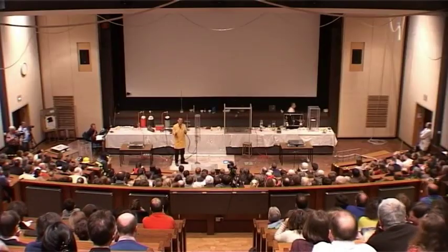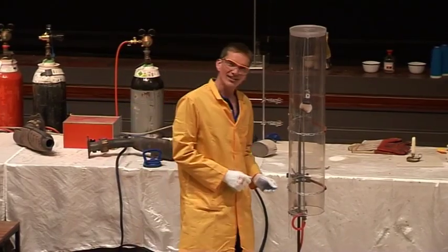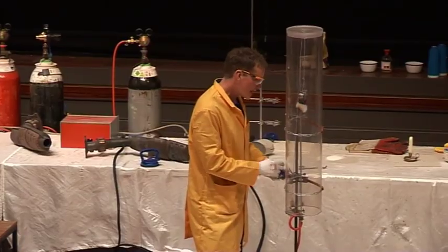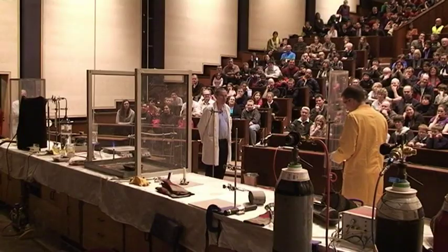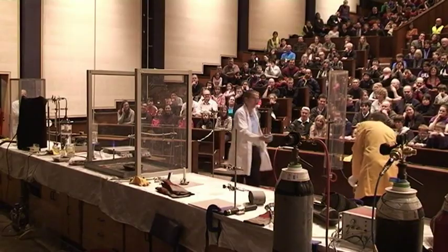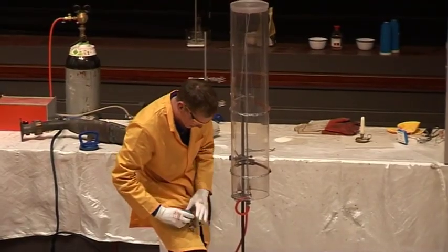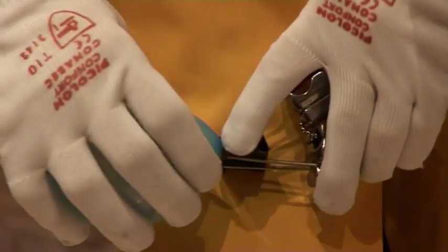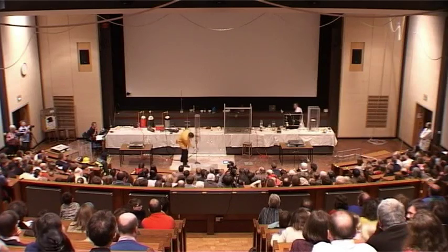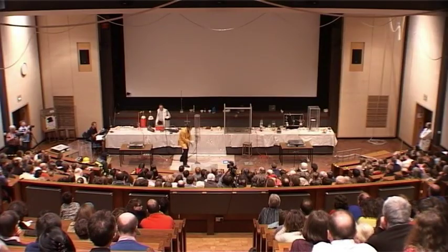Now, remember the balloon filled with oxygen, and it didn't light in air. Will it light in hydrogen? Well, let's give it a try. So we have here a little tiny balloon filled with oxygen. And we're going to see if we can set fire to this. So a little tiny balloon, and we're going to set fire to this in hydrogen. So this is a balloon of oxygen.